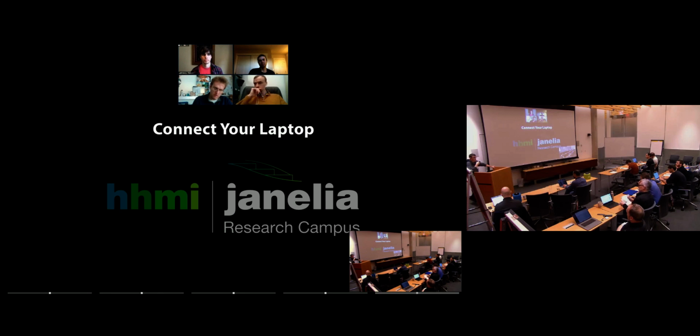And then if you look at the project that Brian is leading, that includes information about chemistry and lot numbers and reagents and all of that other stuff that most graduate students like to just sweep under the rug or write down on a piece of paper somewhere, that we need entered in a database that's going to be recorded and kept, eventually released to the public in a decade. And so, like I said, it's a unique challenge in a software environment to put that in, and integrating with what's essentially a legacy database becomes a giant challenge.